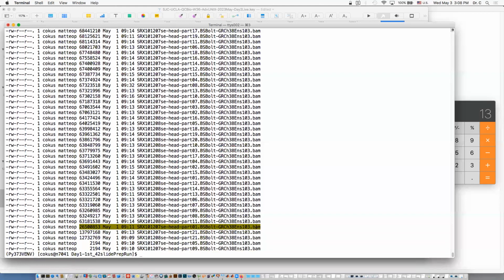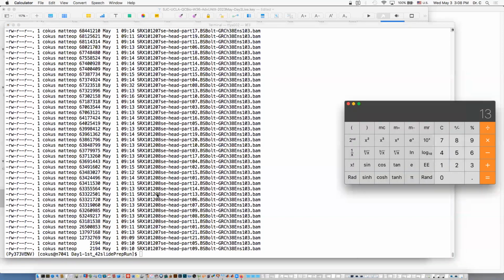But part 7.1 doesn't look good, right? It's a 500K run, but why is it less than half the size of the other ones? That's suspicious. And then 7.5 and 7.9, those look like basically empty. That doesn't look good. So we're very suspicious about 7.1, 5 and 9. 7.1 looks like a partial run, and 7.5 and 9 look like a failed run.